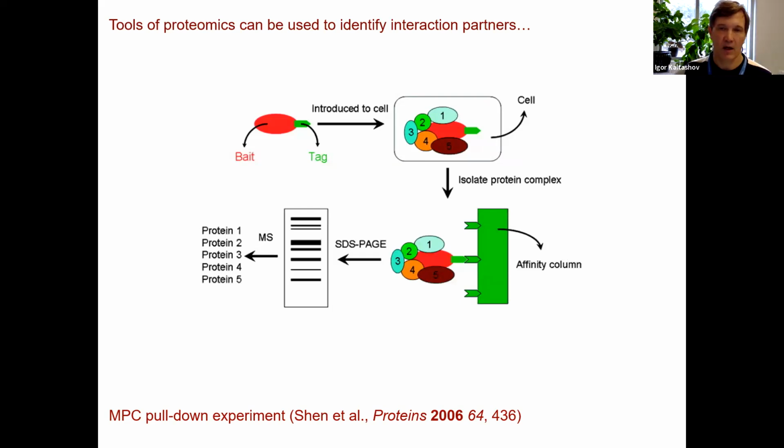Perhaps use SDS-PAGE to separate them out based on their molecular weight, as we discussed in the separations module in this class. And then every individual band can be cut from the gel, and you would redissolve these proteins or whatever biopolymers these ovals represent in solution, and use mass spec in order to find their molecular weight, their sequence, and so that way you would be able to identify them.